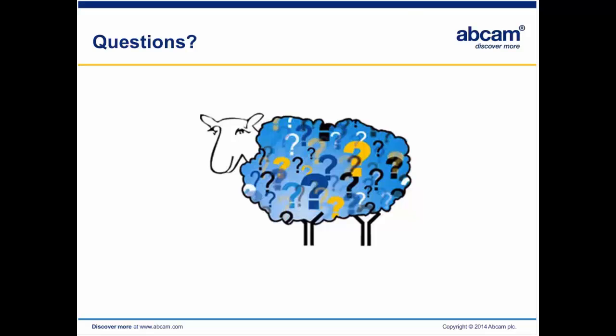And then this is the last question I will answer. The question is: if the number of binding sites falls below 1,000, should I consider my experiment has failed? The short answer is no, you cannot tell whether your ChIP-seq experiment failed or not solely based on the number of binding sites, because the number of binding sites depends on many things, like the expression of the protein, the cell line, the peak caller, and also the cutoff threshold used in the peak calling.